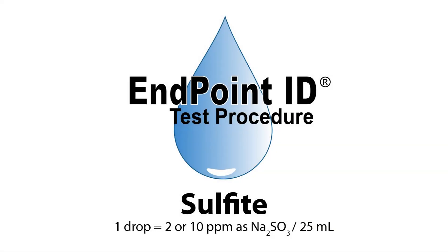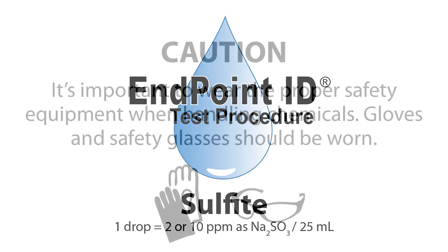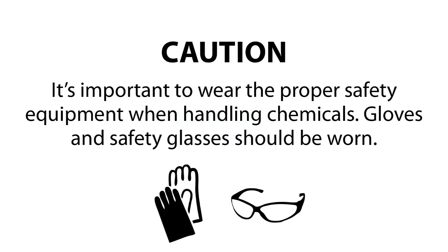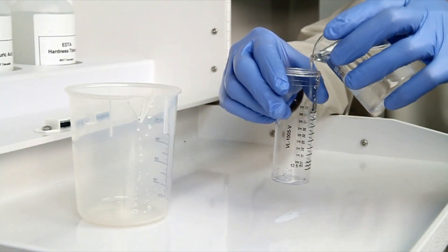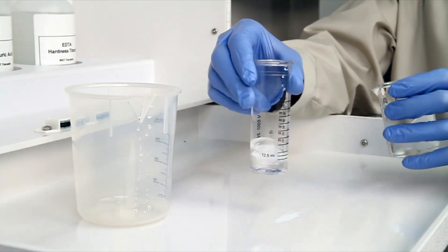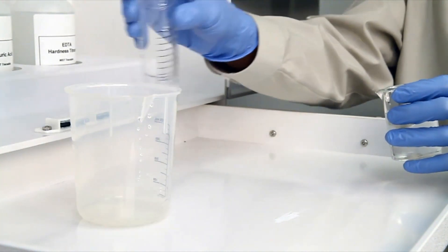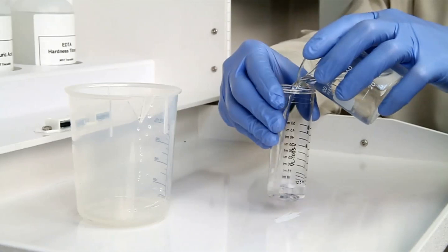This is a demonstration of a sulfite drop count test kit using endpoint ID procedures. The first step according to the endpoint ID procedure is to gather an accurate sample. The smallest change in sample size will lead to inaccurate results.